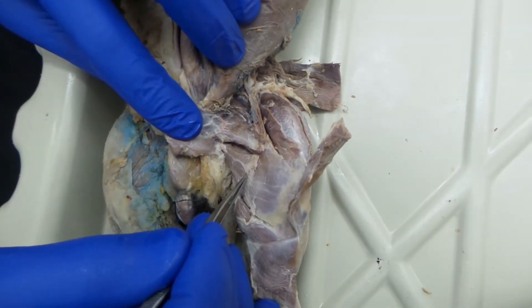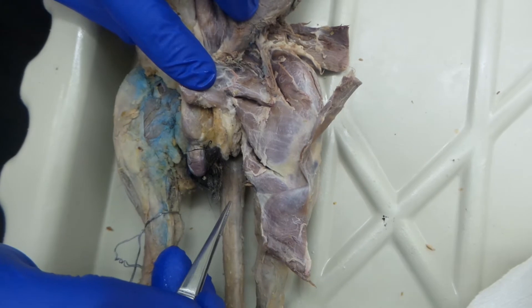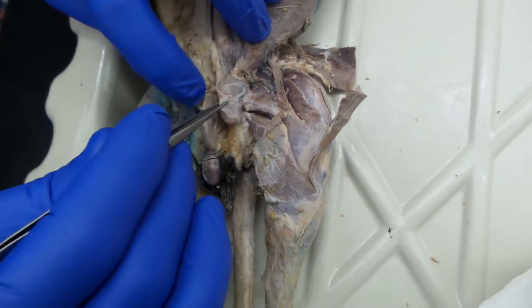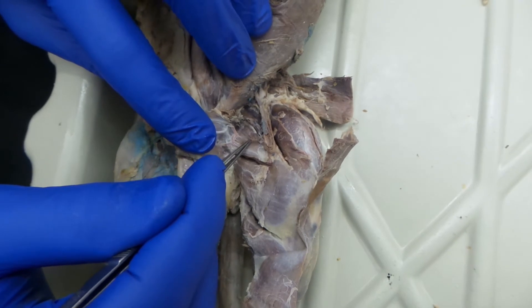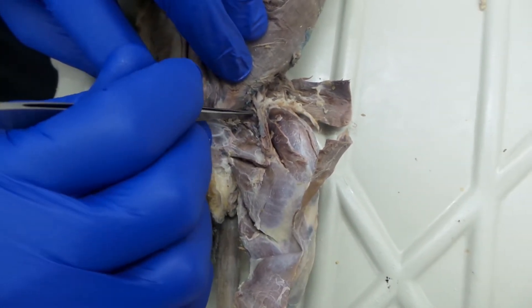Then you have semimembranosis and semitendinosis. So that's it for the medial side. Again, we had gracilis, semitendinosis, semimembranosis, adductor femoris — in humans it's called magnus — adductor longus, and pectineus.